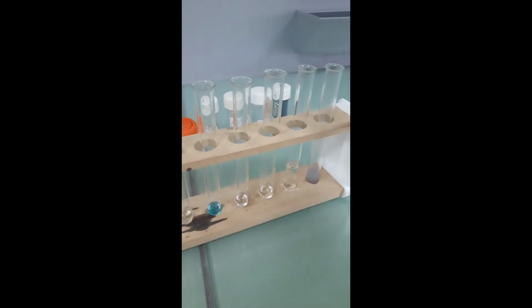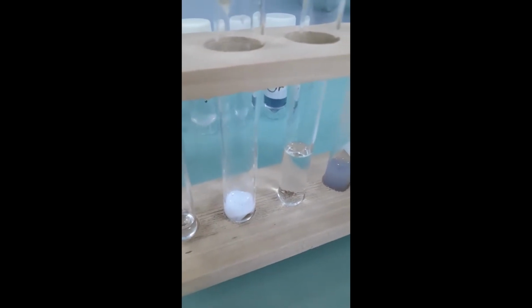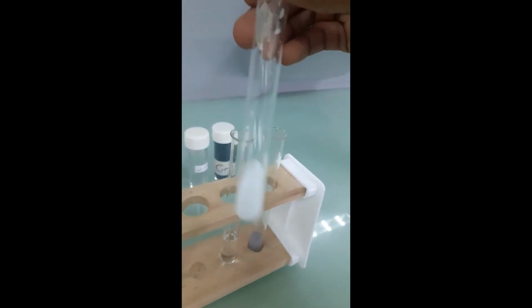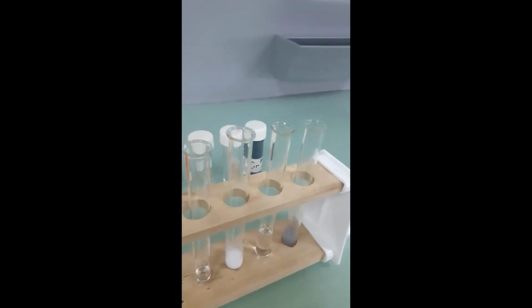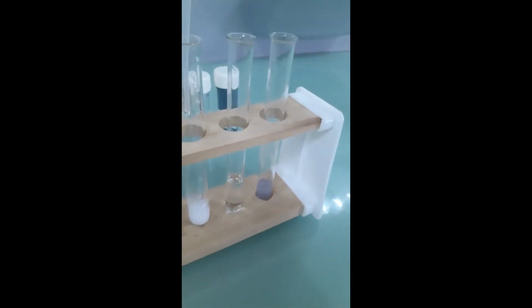In the next test tube, number 3, I have Pb2+, and I will be adding a few drops of dilute ammonia. I'm adding a few more drops of dilute ammonia.